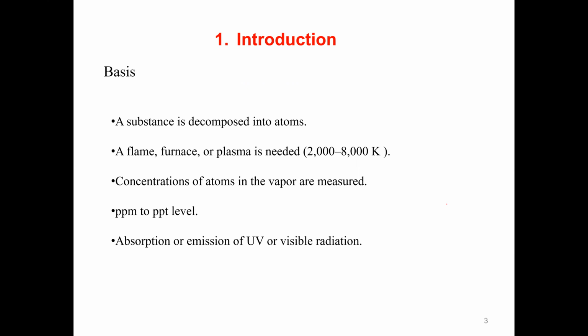If we measure the inner layers, we can also get the spectrum. That's another elemental technique. We call that X-ray spectrum. In the future, we can touch and discuss this technique briefly. Some of you are doing research with that.